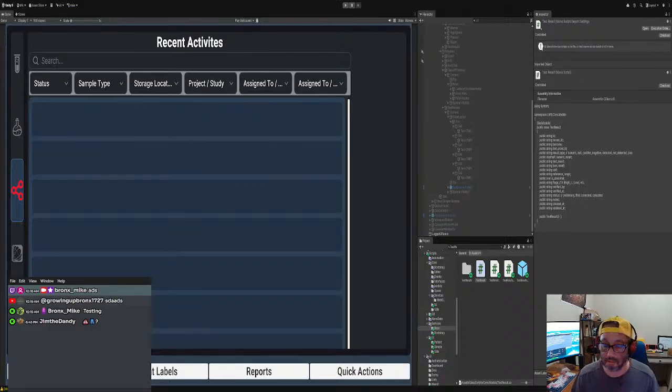All right, so let me see. All right, so how are we getting data? Load data. I don't know why we did. All right, so we gotta follow this pattern.